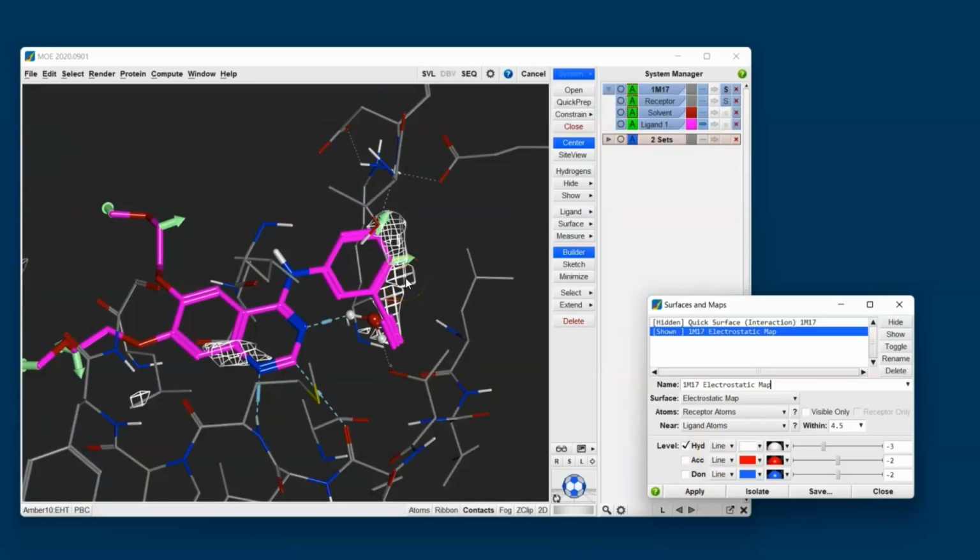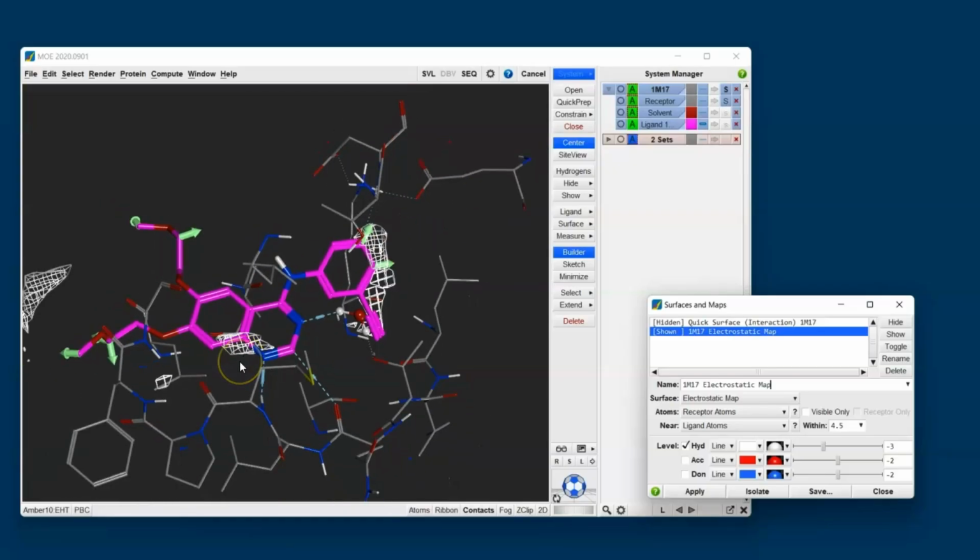Here I can see that the ligand is touching the hotspot and it's got the right type of interaction. So this tells me the ligand is already well optimized for the hydrophobic interactions in not just one, but in two places. If I just zoom out slightly, we can see that there's a third hotspot, but it sits just outside the binding pocket, so I won't concern myself with that. I'll conclude that there's nothing to do to optimize our ligand for a hydrophobic interaction, so I'll move on and have a look at the red acceptor hotspots.